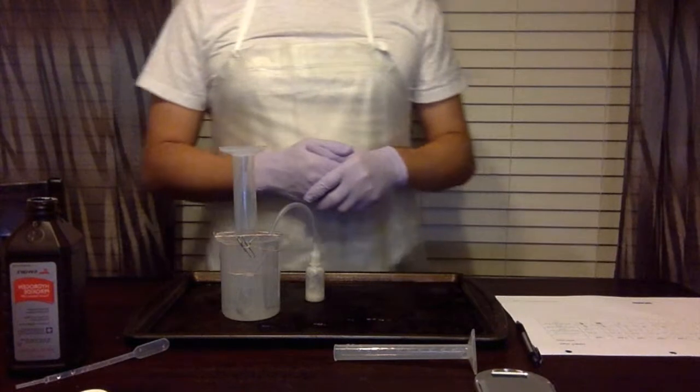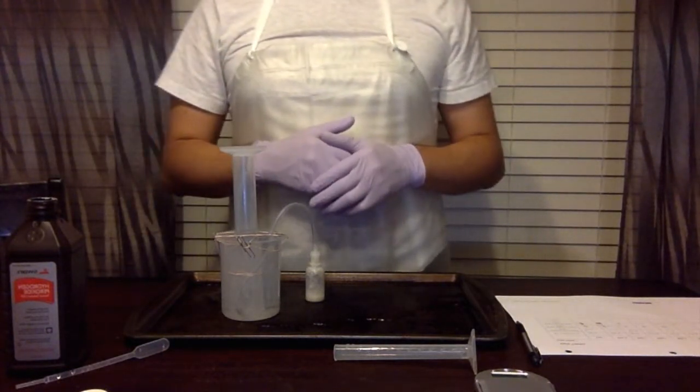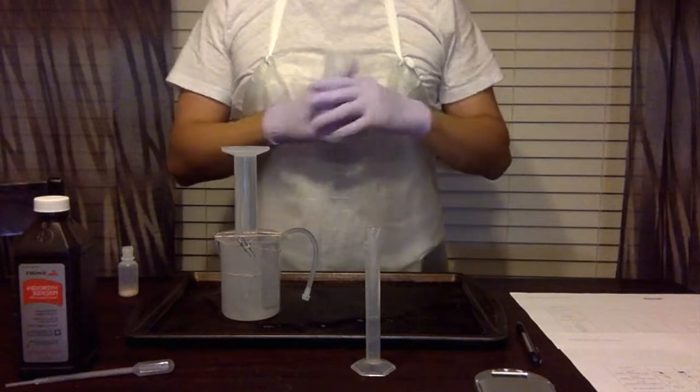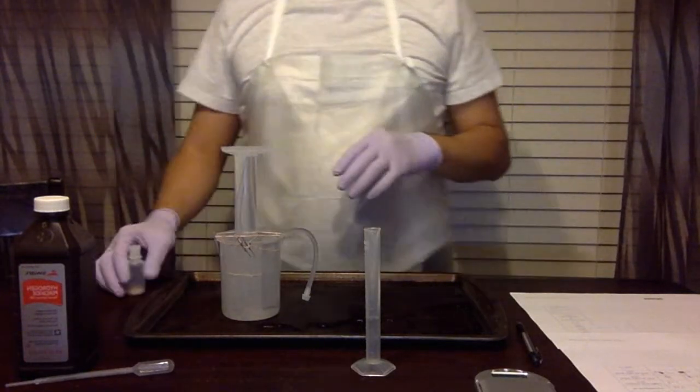All right, we'll be back for trial number 8, which will be our last trial. And again, we will be using 4 milliliters of hydrogen peroxide. All right, we're here, about to commence our final trial, which is trial number 8.